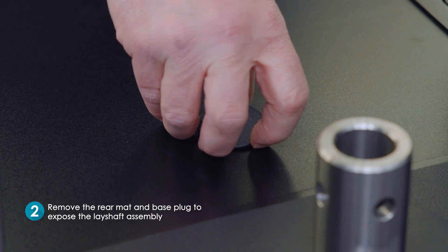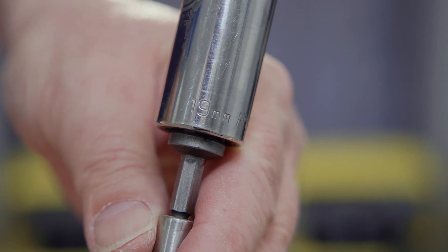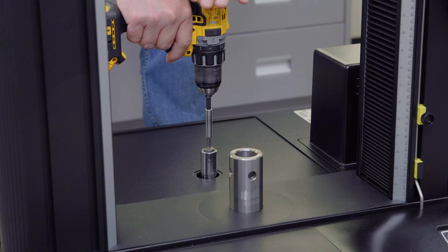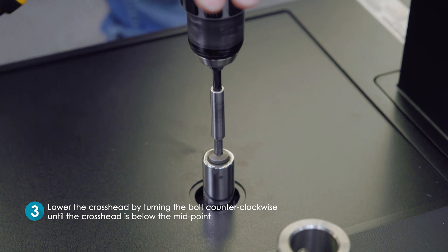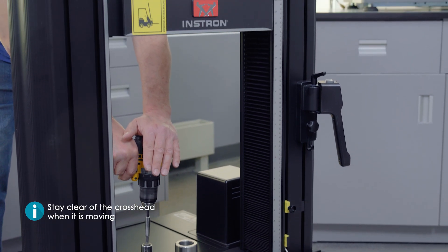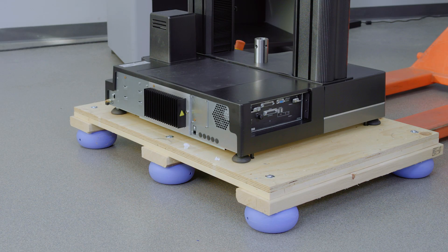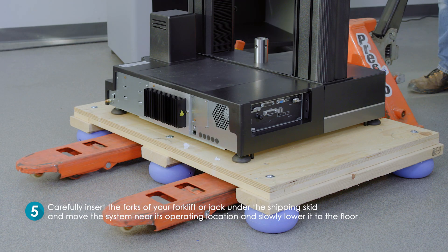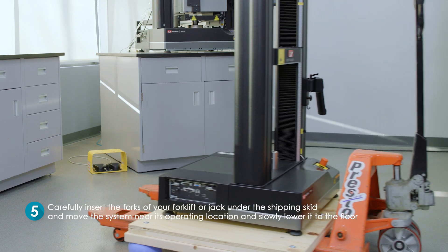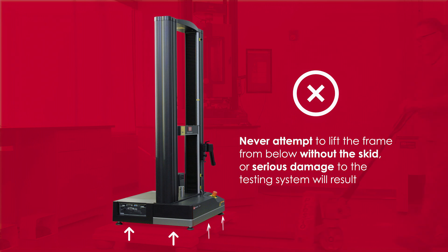Remove the rear mat and base plug to expose the lay shaft assembly. Using a 19mm socket and power drill at low speed, lower the crosshead by turning the bolt counterclockwise until the crosshead is below the midpoint. Ensure that you stay clear of the crosshead when it is moving, then replace the plug and mat. At this point, you can carefully insert the forks of your forklift or jack under the shipping skid and move the system near its operating location and slowly lower it to the floor. Never attempt to lift the frame from below without the skid, or serious damage to the testing system will result.